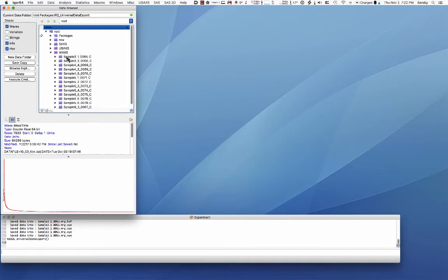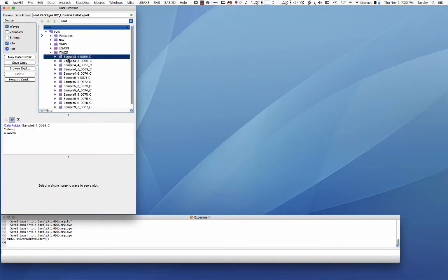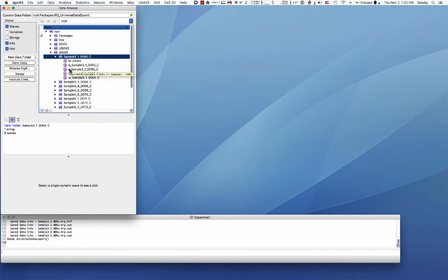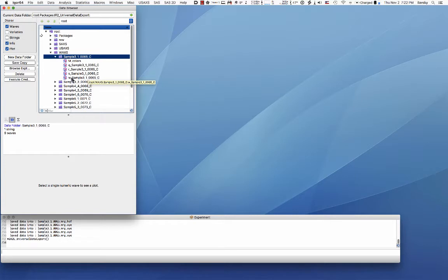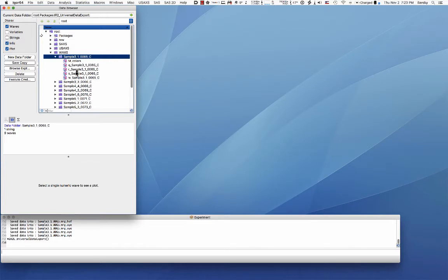Now if you use the NIKA package the data are coming out as what is called QRS. So if you look on it's different. Each one of your samples still has a folder but inside that folder are not DSM or SMR data that's not applicable for pinhole type data from these detectors. What you find in there is Q_ and a sample name, R which is an intensity_, S which is uncertainty and W which is actually the Q resolution.